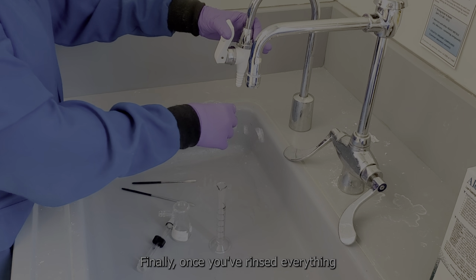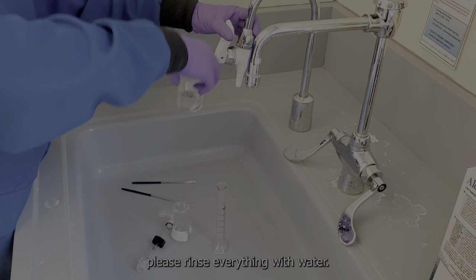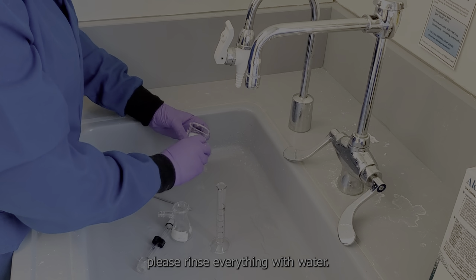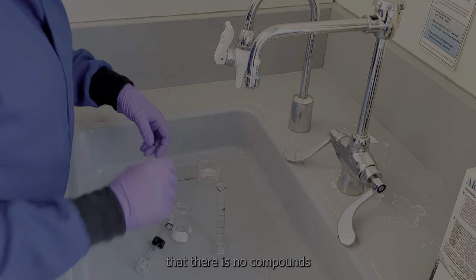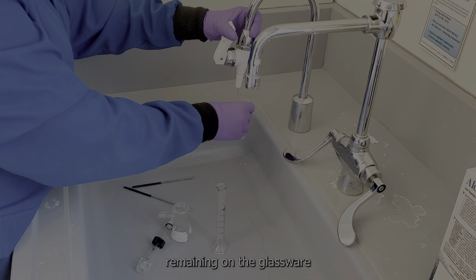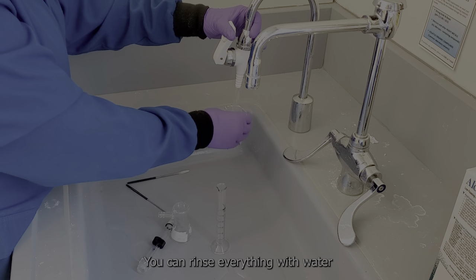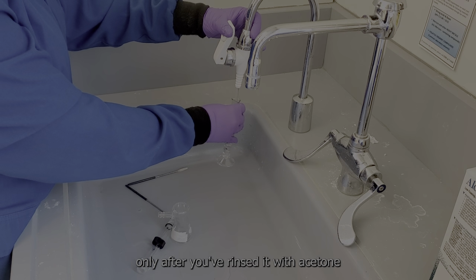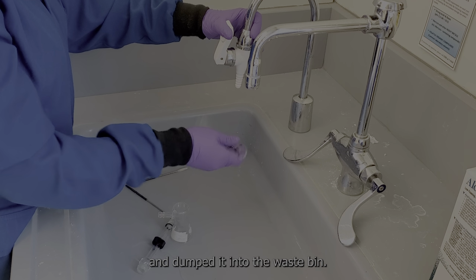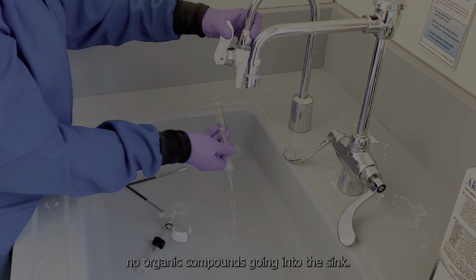Finally, once you've rinsed everything with acetone and allowed it to dry, please rinse everything with water. The reason is to ensure that there are no compounds remaining on the glassware and it's clean for the next person to use. You can rinse everything with water only after you've rinsed it with acetone and dumped it into the waste bin. This ensures that there are no organic compounds going into the sink.